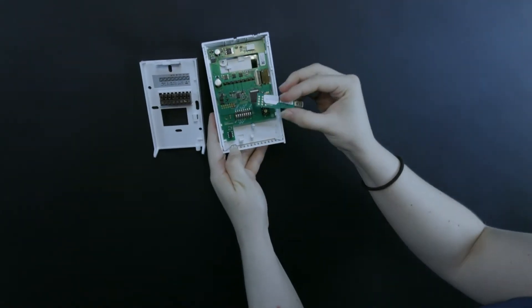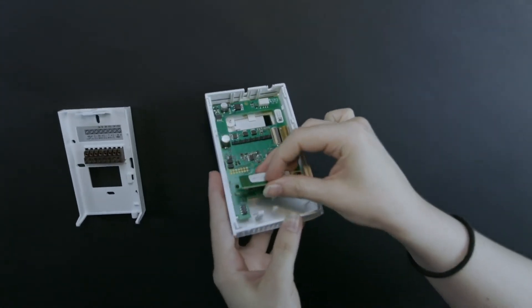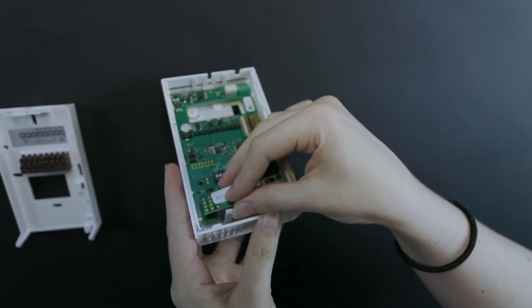As you can see, changing out the measurement module does not require any wiring or special knowledge, which is great for anyone with limited facilities resources.